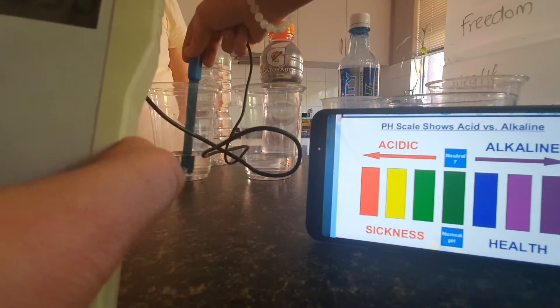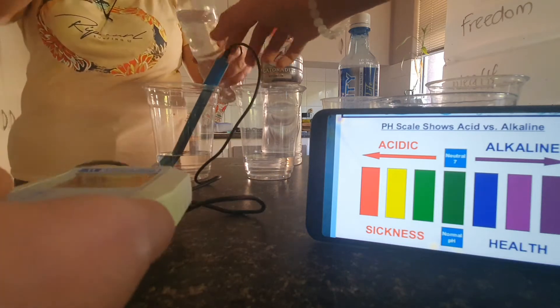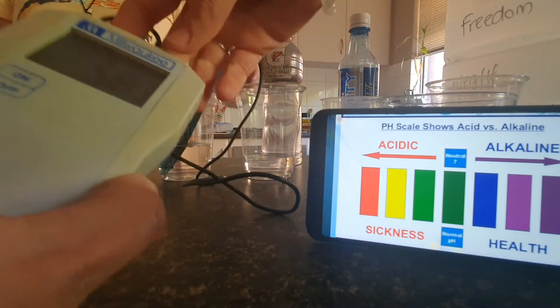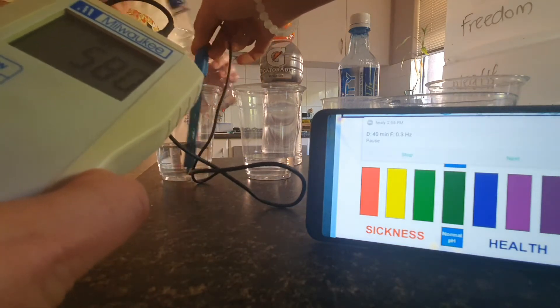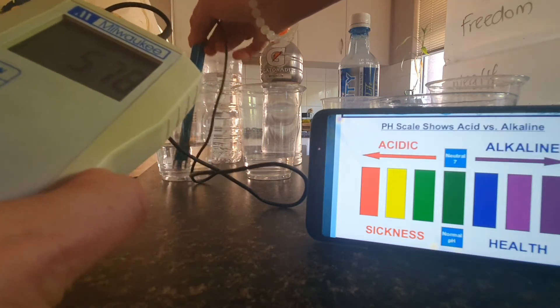Could I get a little bit more water of this one in there? So as soon as I've dunked that in there, the ORP meter has shot up to like positive 600. So that's not a good reading. It's a bad reading when it comes to terms of health.